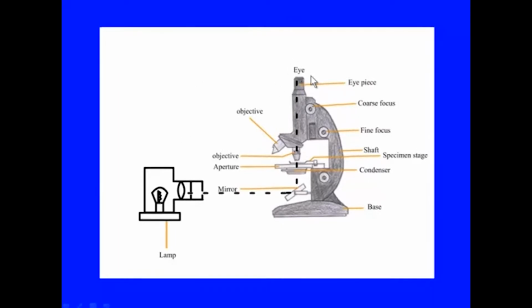Now, let us discuss some of the parts here to understand the microscope. Here is the condenser lens, which we will be discussing in detail also. The condenser lens forms a very fine focused light onto the specimen, to avoid any stray light which could form a diffused image. Always there is a diffusing screen put after the light source and before the condenser, so that the image of the light source is not formed here.